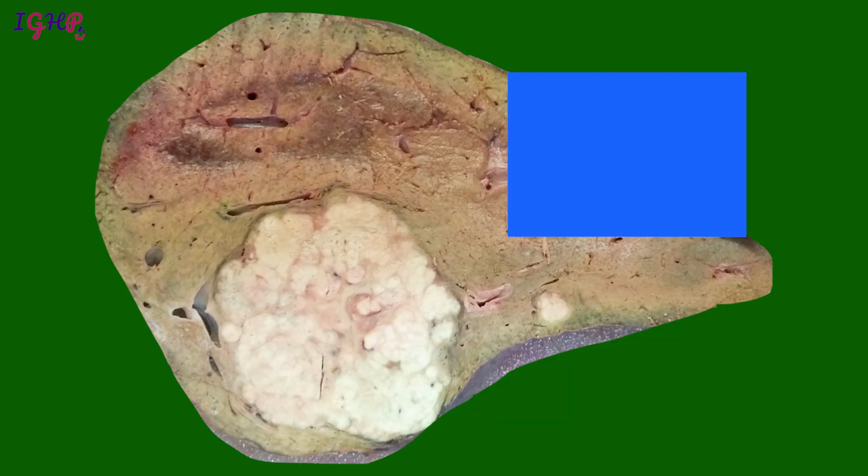Now this again is a well-defined specimen. This is a well-defined tumor margin, and from the description itself, I would say that this is grey tan in color, and this is also showing a lobulated pattern as opposed to the previous one which had a smooth cut surface. This shows a vague lobulated pattern, but the margins are again well-defined. When you describe a thing like this, it again shows that you are talking of some benign etiology.